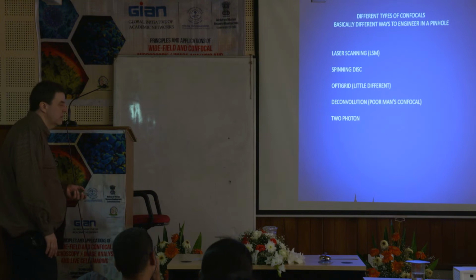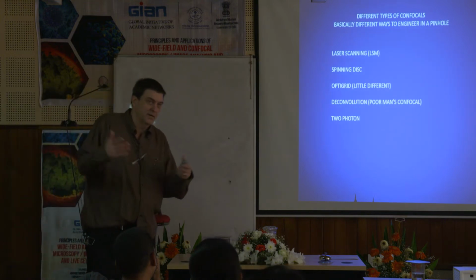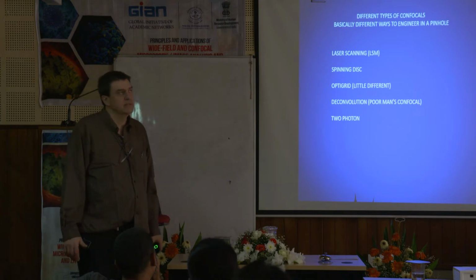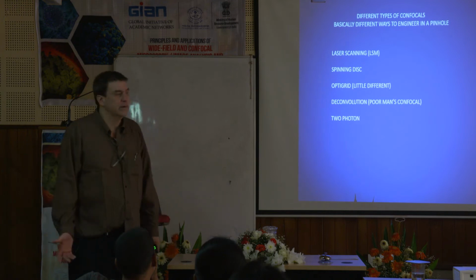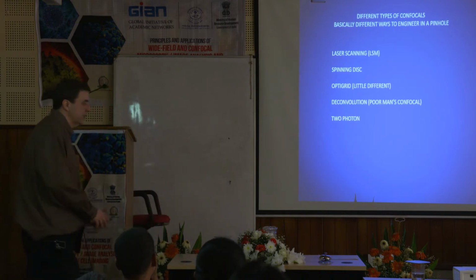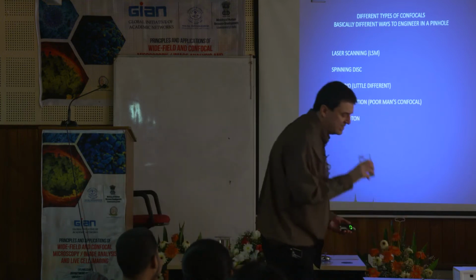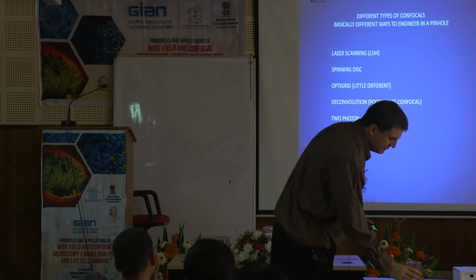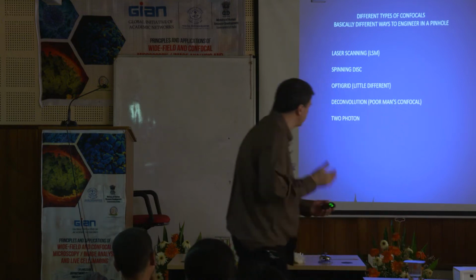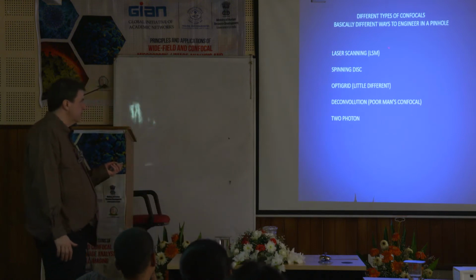Okay, so obviously the pinhole or the confocal was a big hit when it came out. People are like, wow, this is a really nice tool, really useful. And then like any nice tool, people start improving upon it. And people come up with different ways to do it. Okay, so of course, when this came out, I think it was late 80s. I'm pretty sure it was late 80s. It might have been mid 80s, but I think it was late 80s. Anyway, the one you have is called laser scanning.